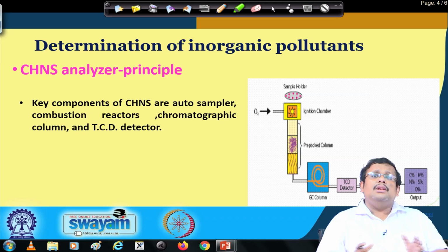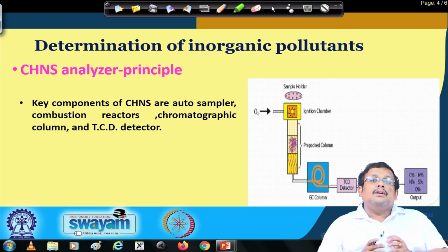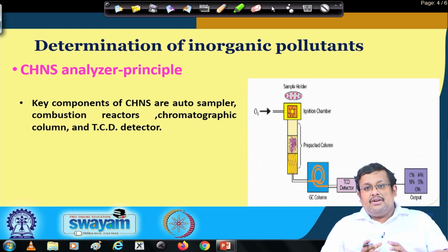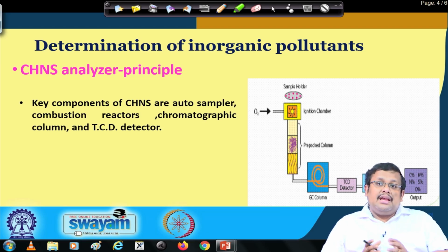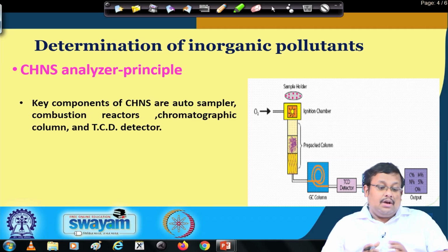So, all these instruments are required when you are going to measure the concentration of different forms of nitrogen in different environmental samples, and thus these instruments are an integral part of any sophisticated environmental soil chemistry lab. You will see them very often.